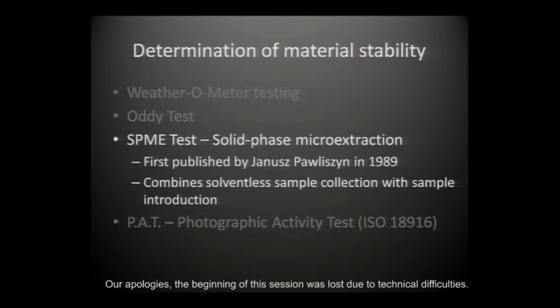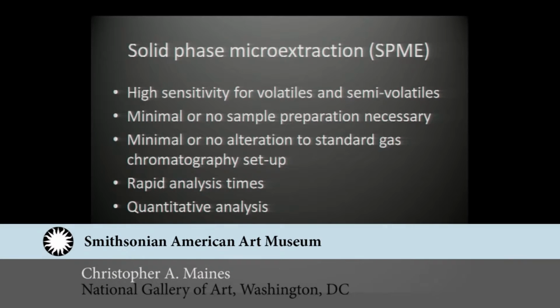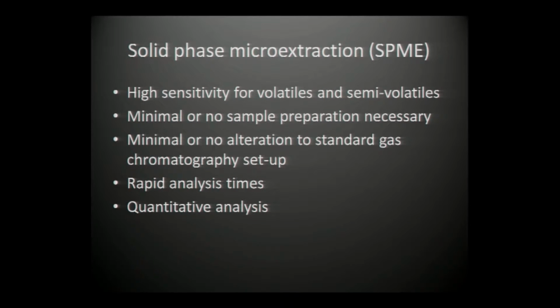Along with the same material, it is used to then introduce the sample into a gas chromatograph. The advantages of this over many other tests are that it has a high sensitivity for volatiles and semivolatiles. There is minimal to no sample preparation necessary. Essentially, all you have to do is get a sample of the appropriate size to use for your sample vials.